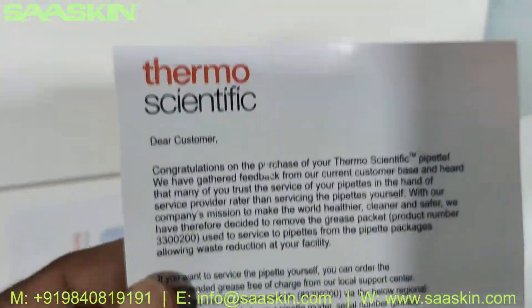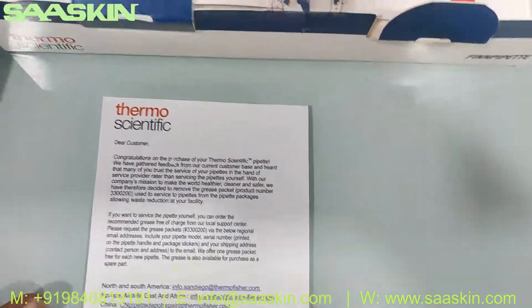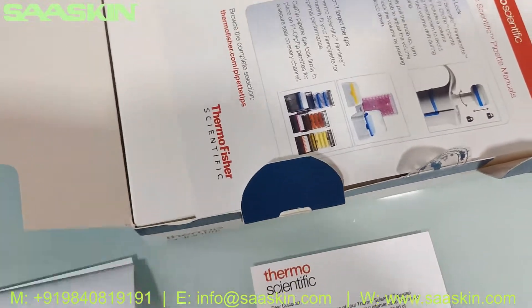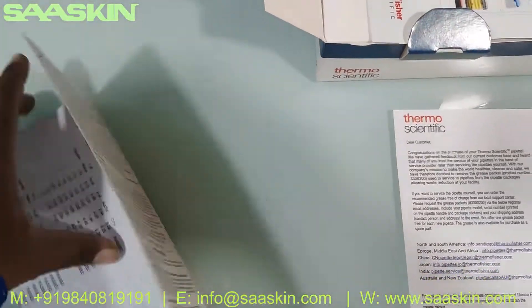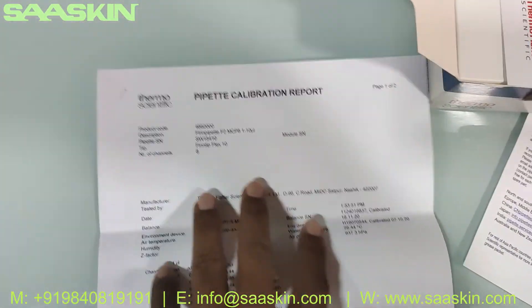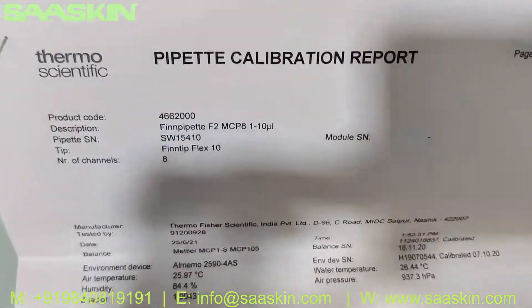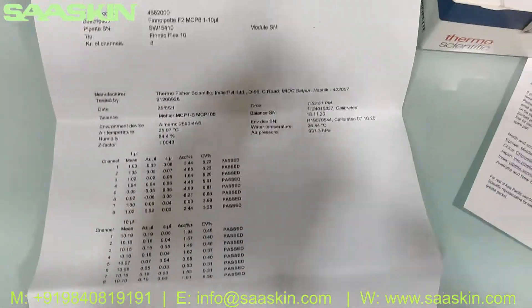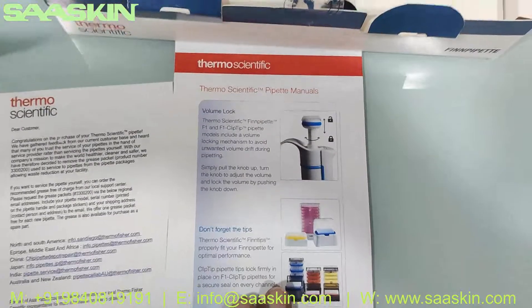There's also a welcome card for customers. Pinned along with the warranty card is the pipette calibration report. So you get a calibration report, the warranty card, a customer welcome kit, and there is also a manual about the kit.